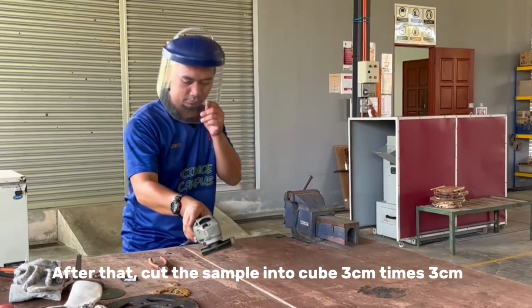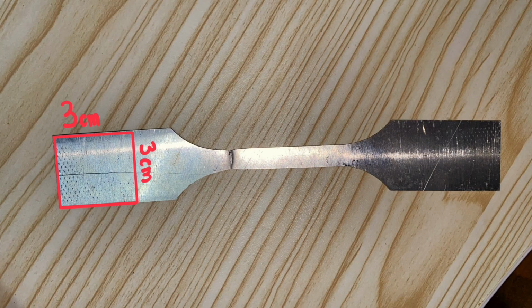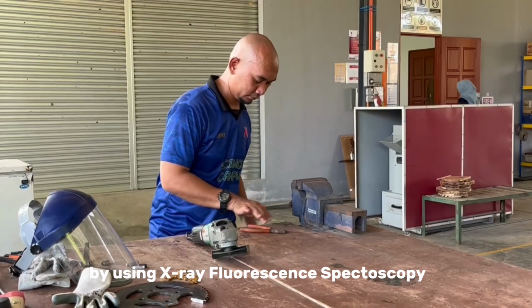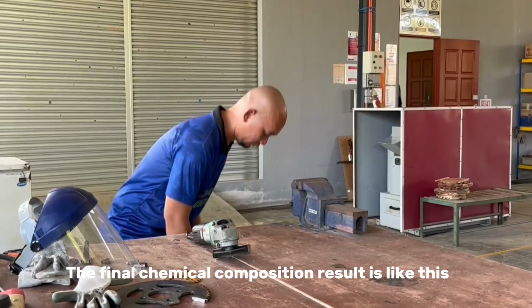After that, cut the sample into a cube 3 cm times 3 cm. This is to test the chemical composition of both of the materials. By using X-ray fluorescence spectroscopy, the final chemical composition result is like this.